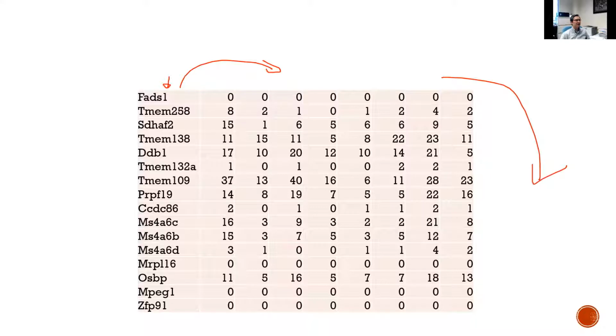After that, the columns will become genes, gene 1 to n, and the cells will be in the rows. You don't have to do this, but in data science, people normally put the samples in the rows and the features, which describe the samples, as variables in the columns.